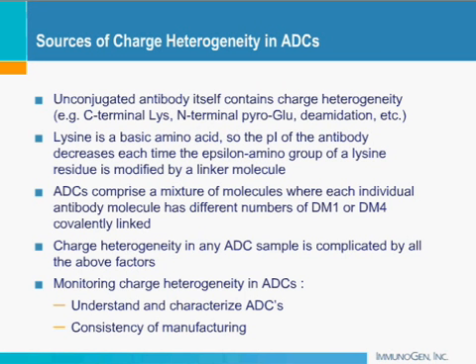Histidine, being an amino acid, has a pI of 7.6, which overlaps with the range of the pI of the ADC molecule. We see it focuses at that point, and it displaces the charged species of the conjugate and creates this gap. That's simply because the histidine does not absorb at 280, and you see just a plain gap in the profile. This issue can be easily resolved by doing a simple buffer exchange of your analyte into a compatible buffer. So sometimes even your formulation buffer components can interfere with the analysis and need to be considered for method development.